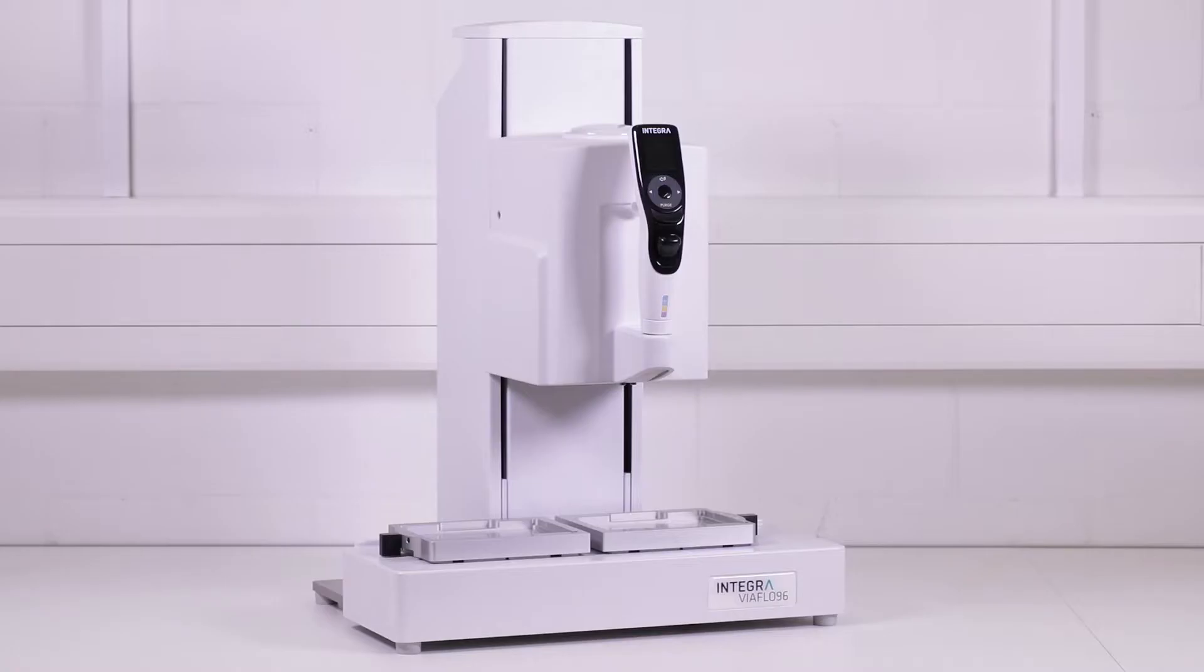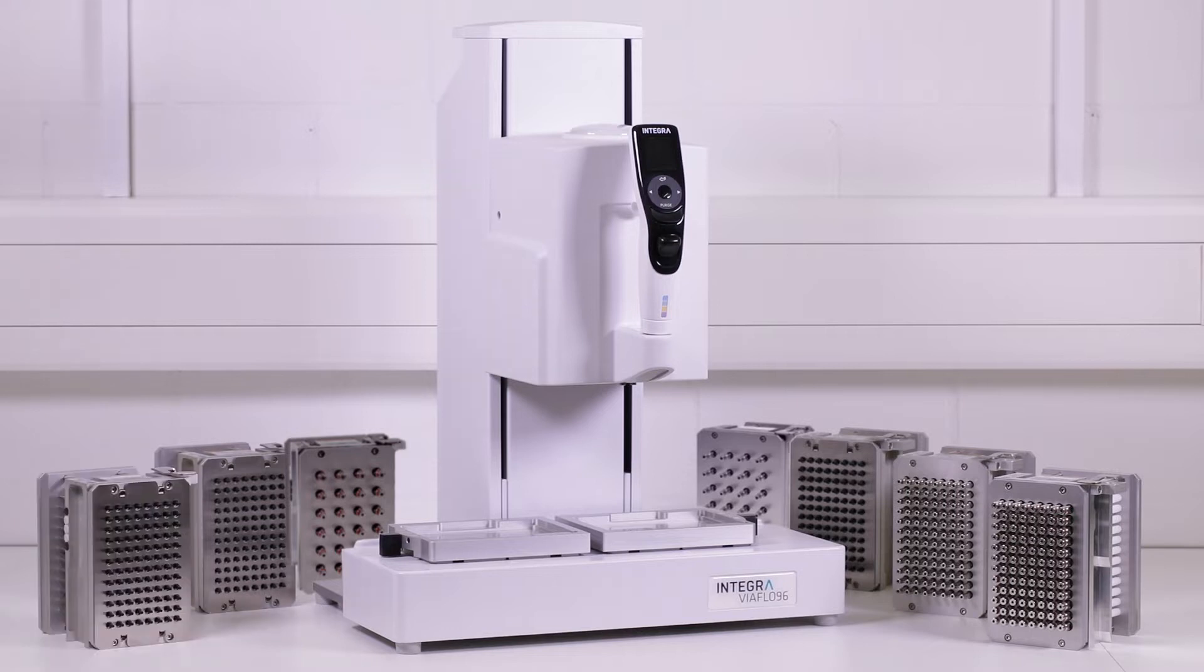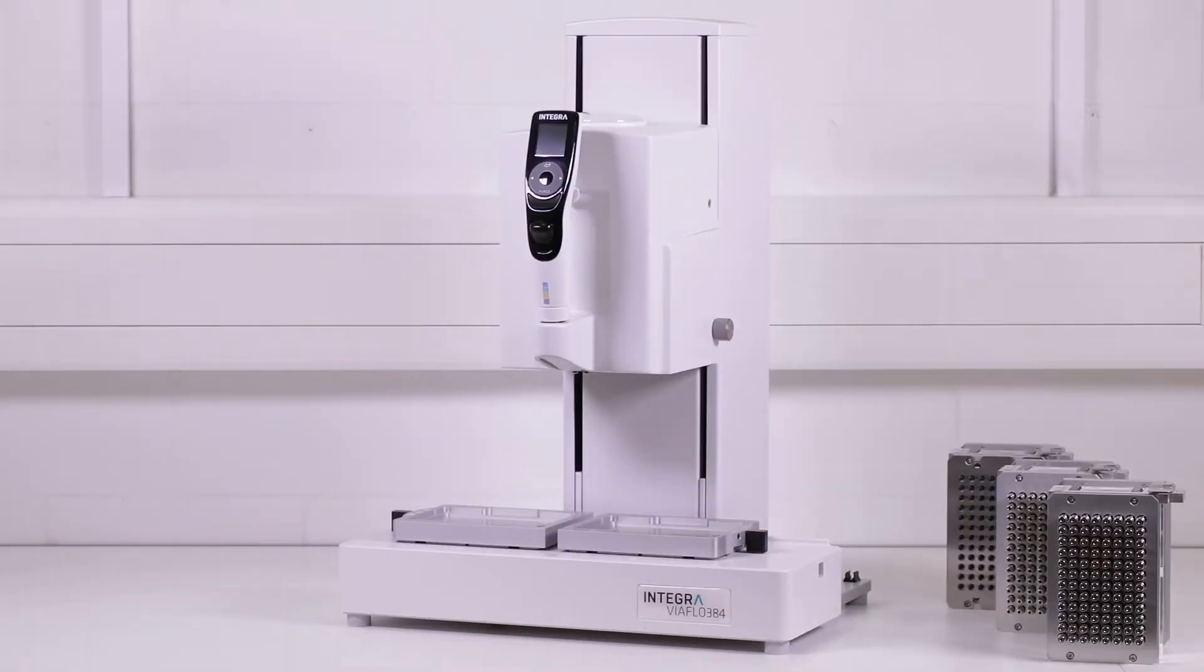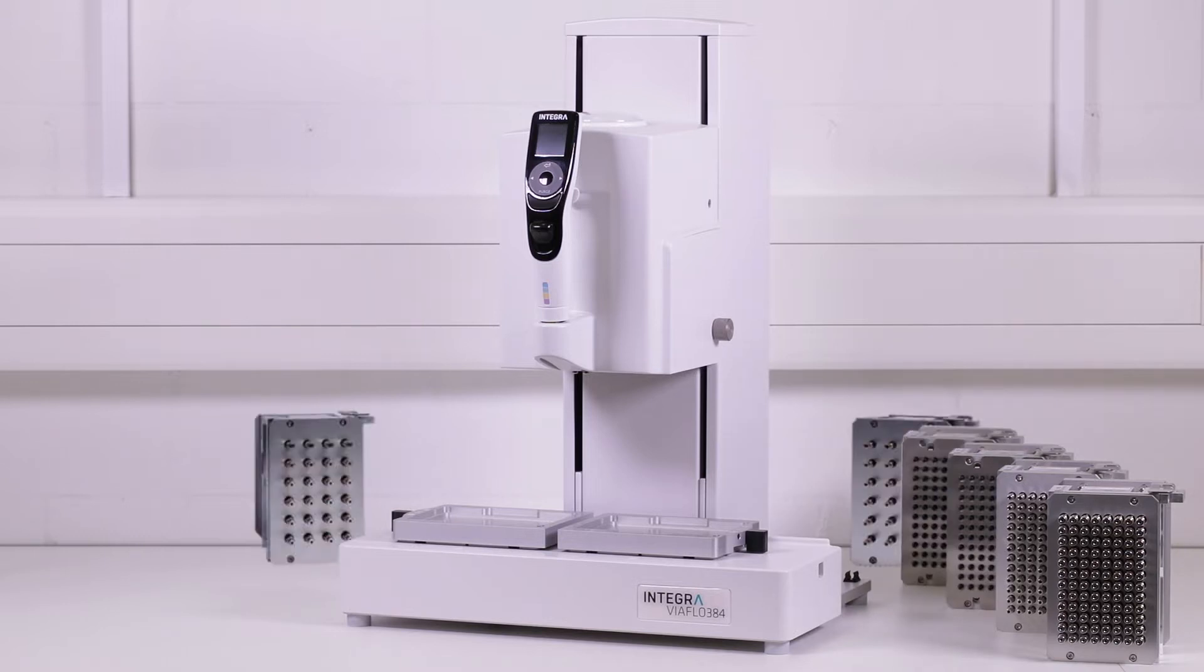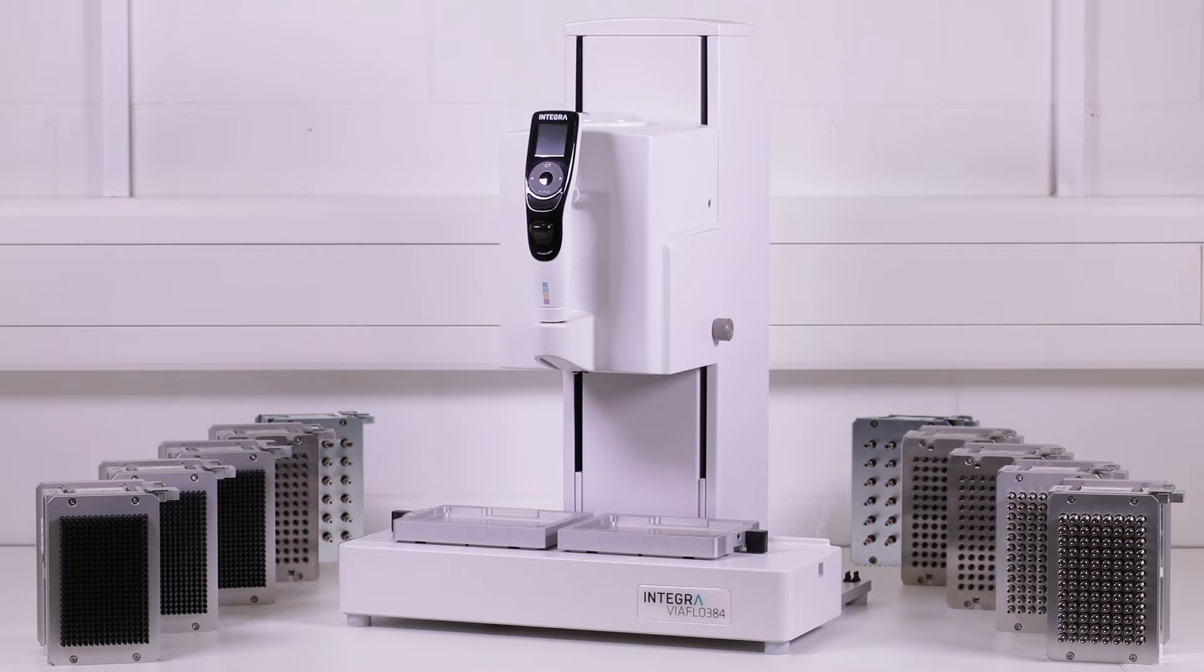Two different base units are available. The ViaFlow 96 offers 24 and 96 channel heads in a variety of volume ranges. The ViaFlow 384 accommodates 24, 96 and 384 channel heads, offering even higher throughput and possibilities.